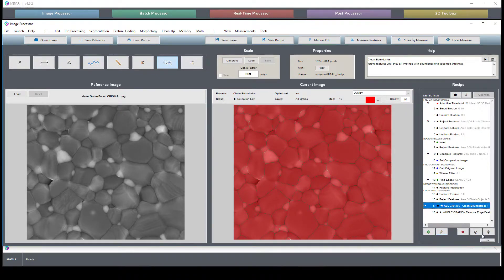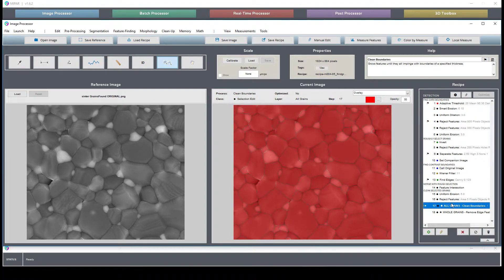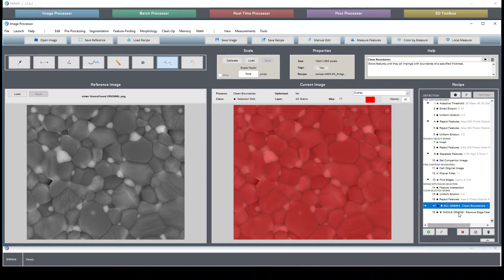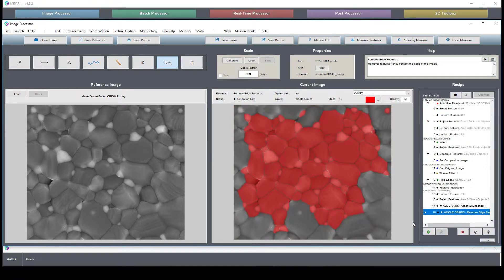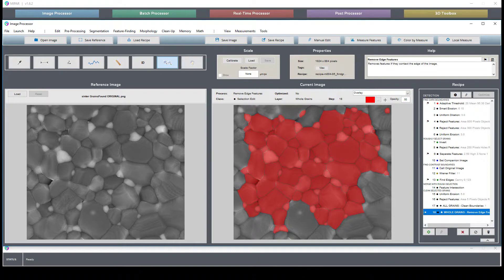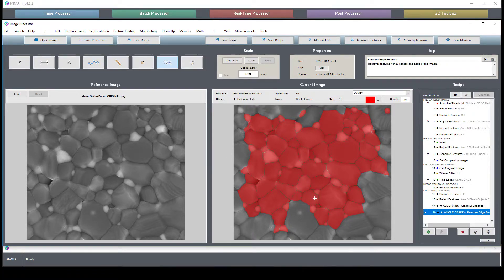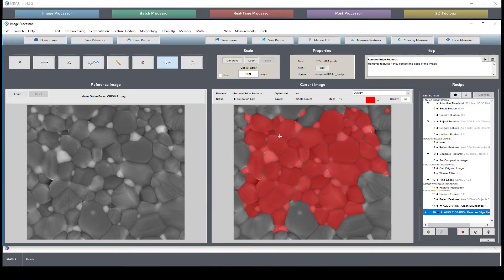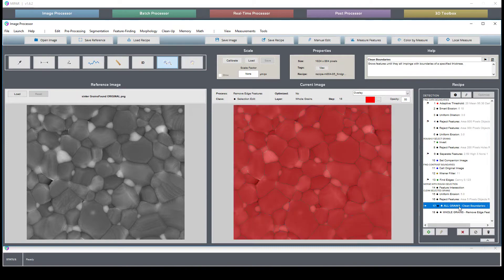So the way I have this set up is I have two layers. One is the all grains, the second one is the whole grains. So all we're doing here is we are removing any partial grains from the image. That way when I go to generate measurements, I'm only generating measurements on whole particles or whole grains.